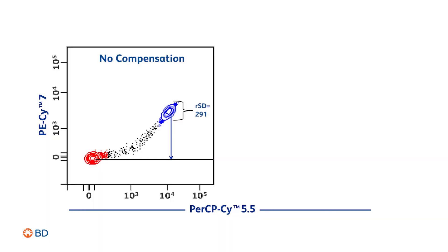Understanding the relationship between fluorescence spillover and spread is important for panel design because spread can significantly impact the resolution of your study. Fluorescence spillover occurs when one fluorochrome emits into a secondary detector. This causes higher background and increased spread, measured as robust standard deviation, in these detectors. In this example, the PerCP Cy5.5 is spilling into the PE Cy7 detector.